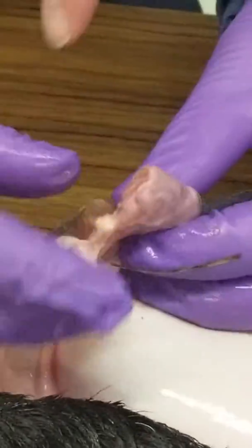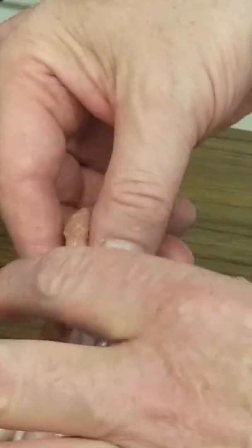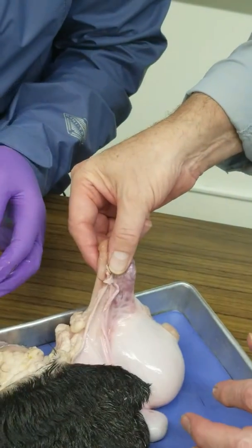This is the spermatic cord. This all would be spermatic cord. You've got the ductus deferens around the vasculature, so the whole thing is wrapped by the spermatic cord.